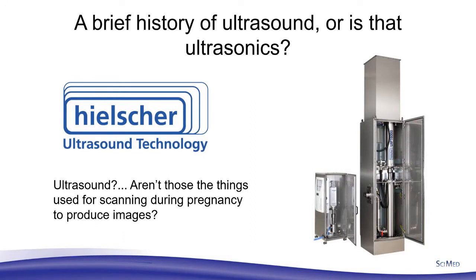First things first though, ultrasound, or is that ultrasonics? Well, it's both. They're interchangeable, but oddly enough, this is the question I get asked more than anything else when people hear about ultrasound or ultrasonics for the first time. Oh, isn't that the instrument used for scanning during pregnancies?